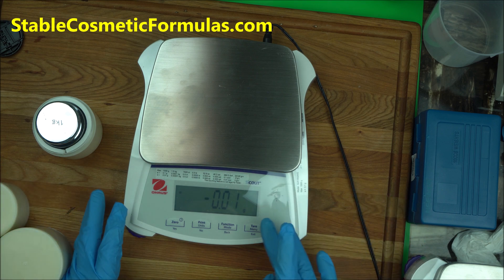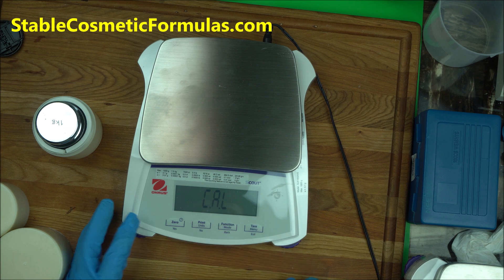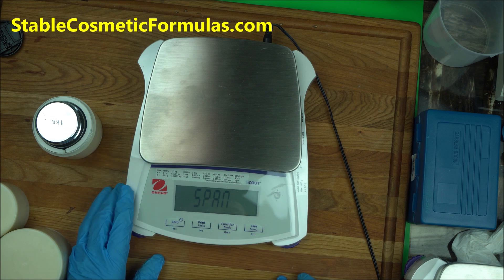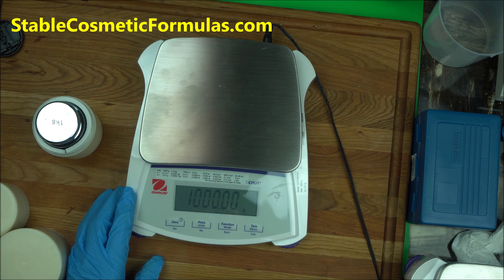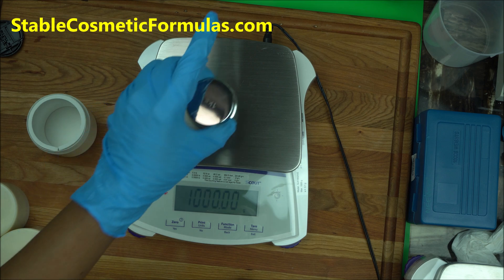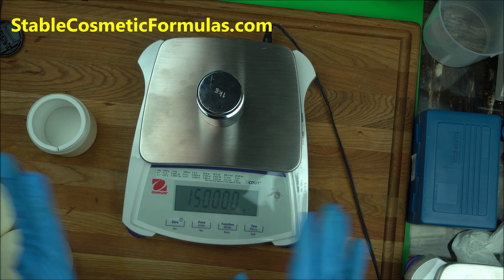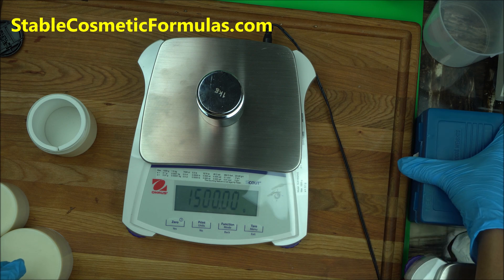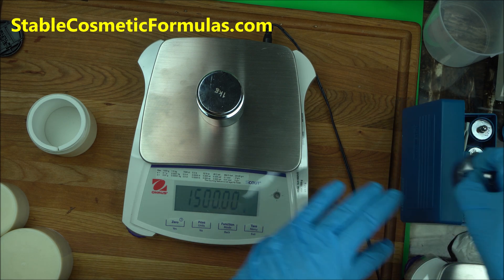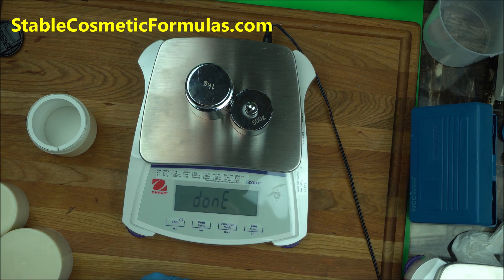Now for the second calibration: press the menu button again until you see 'CAL,' press zero for yes. It will ask 'Is this span?' — press no. Then it asks 'Is this linear?' — press yes. It will now tell you to put 1000 grams, so place 1000 grams on it, then add another 500 grams to make 1500 grams total.